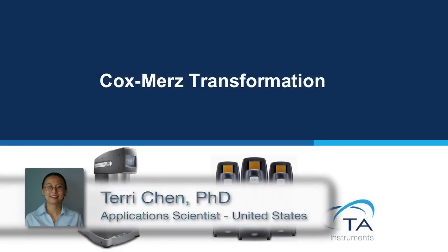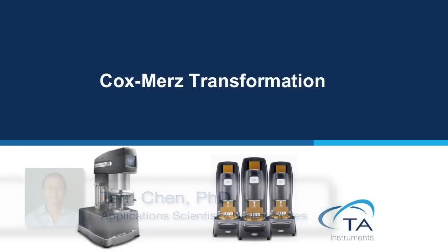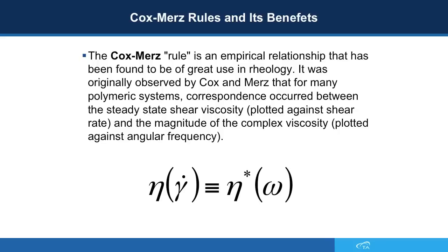This TA Tech Tip is going to show you how to perform Cox-Merz transformation using TRIOS software. The Cox-Merz rule is an empirical relationship that has been found to be of great value in rheology. It was originally observed by Cox and Merz that for many polymeric systems, correspondence occurred between the steady shear viscosity plotted against shear rate and the magnitude of complex viscosity plotted against angular frequency.